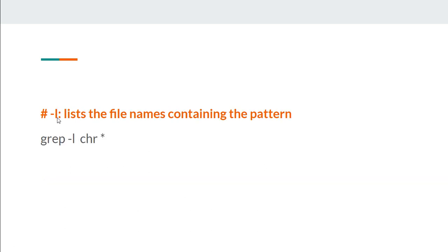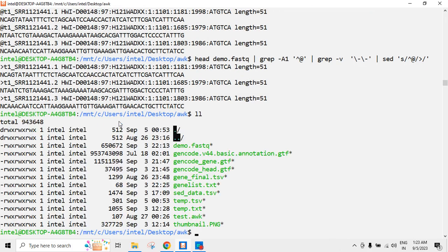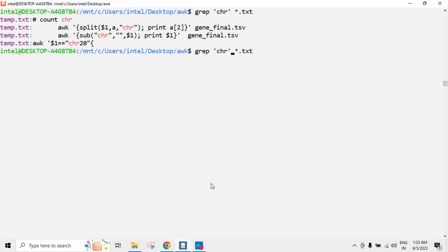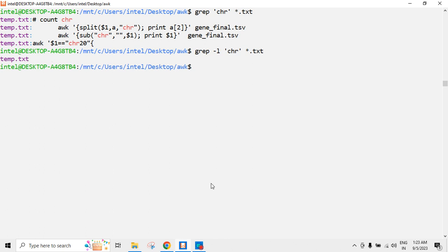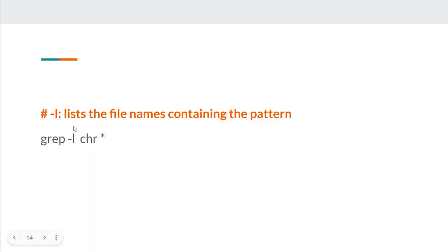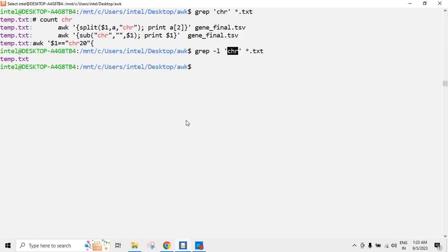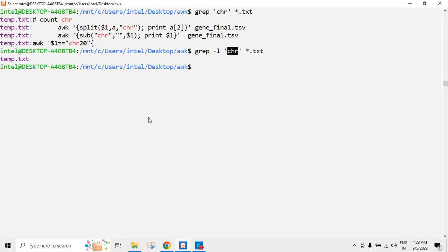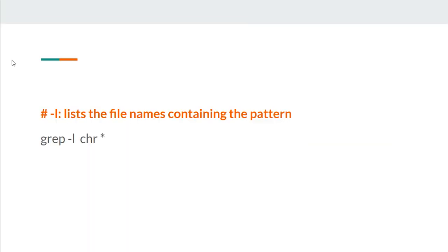Now hyphen L is the next option. If I have multiple files — say star.txt — and I want to search for a pattern like CHR across all of them, hyphen L will give me the list of file names that contain that pattern. So this is the only file where CHR is present. Hyphen L lists the file names which contain the matching pattern.